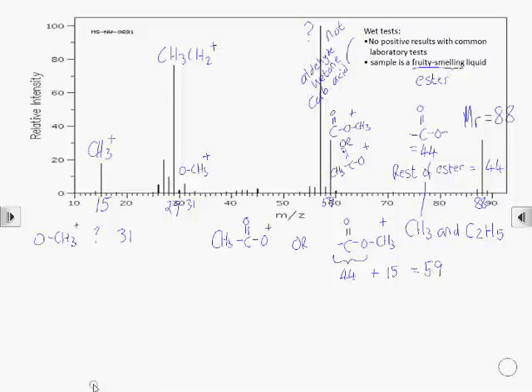We could also look at whether the methyl is connected to the carbon of the carbonyl group. That would come to 43. We really don't have much of a peak at 43, so it doesn't look like the methyl is connected to the carbonyl carbon. Let's try the ethyl group there: C2H5CO. That fragment ion would have a mass of 29 plus 12 plus 16, which is 57. So it looks like we've found the large peak.